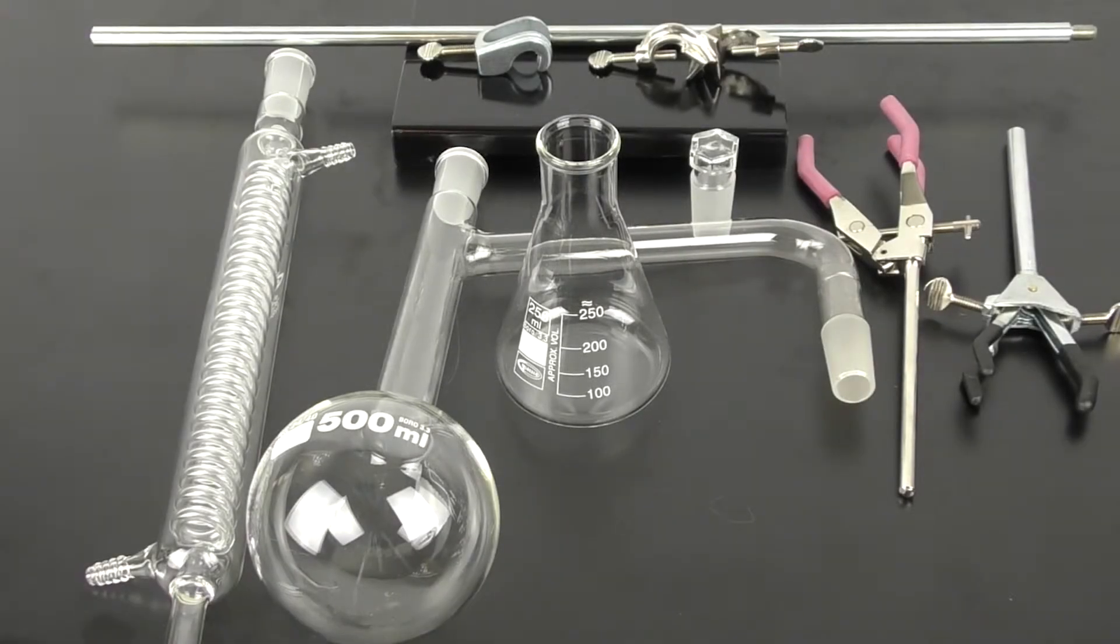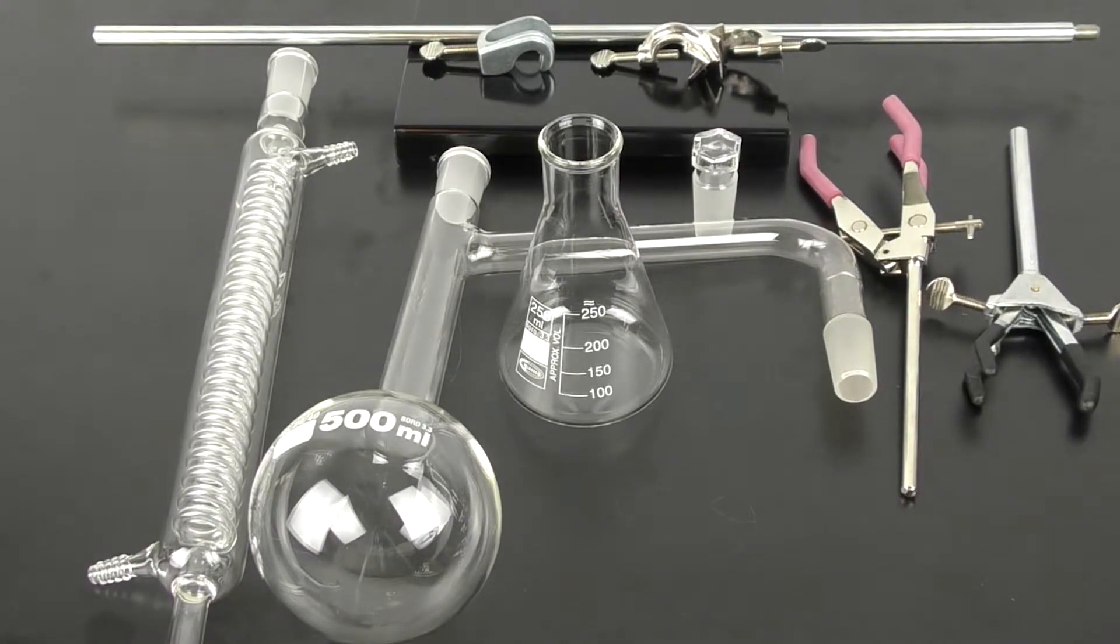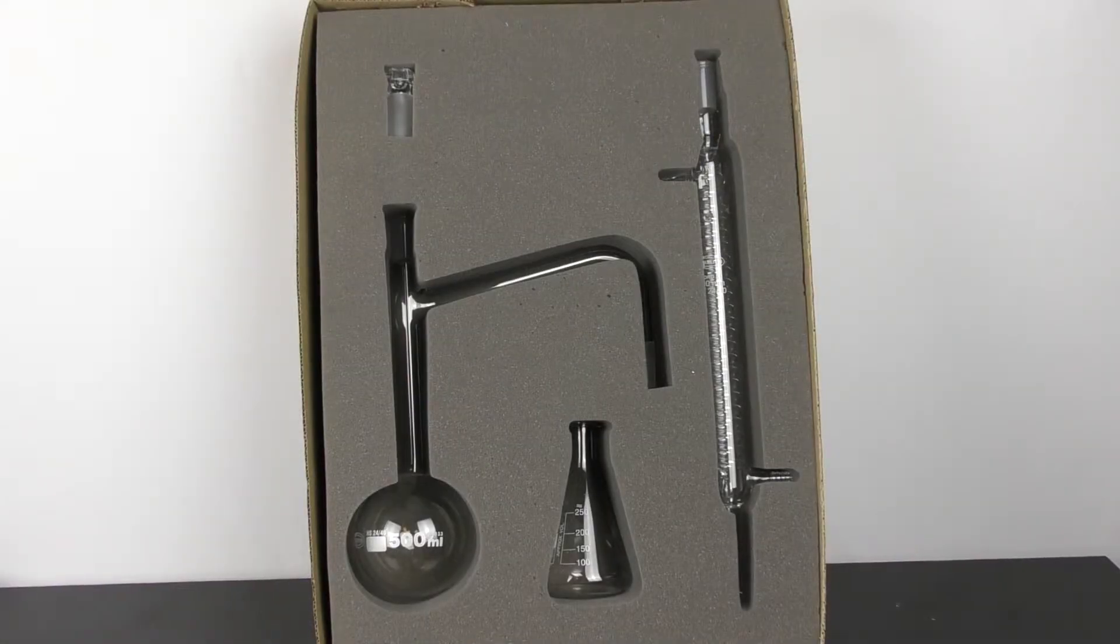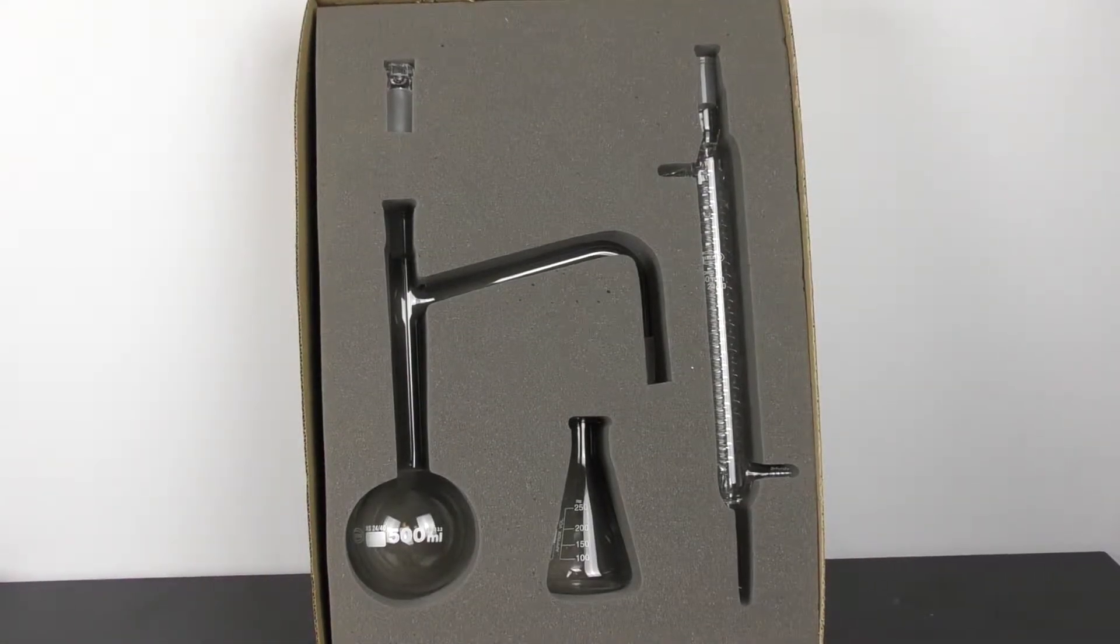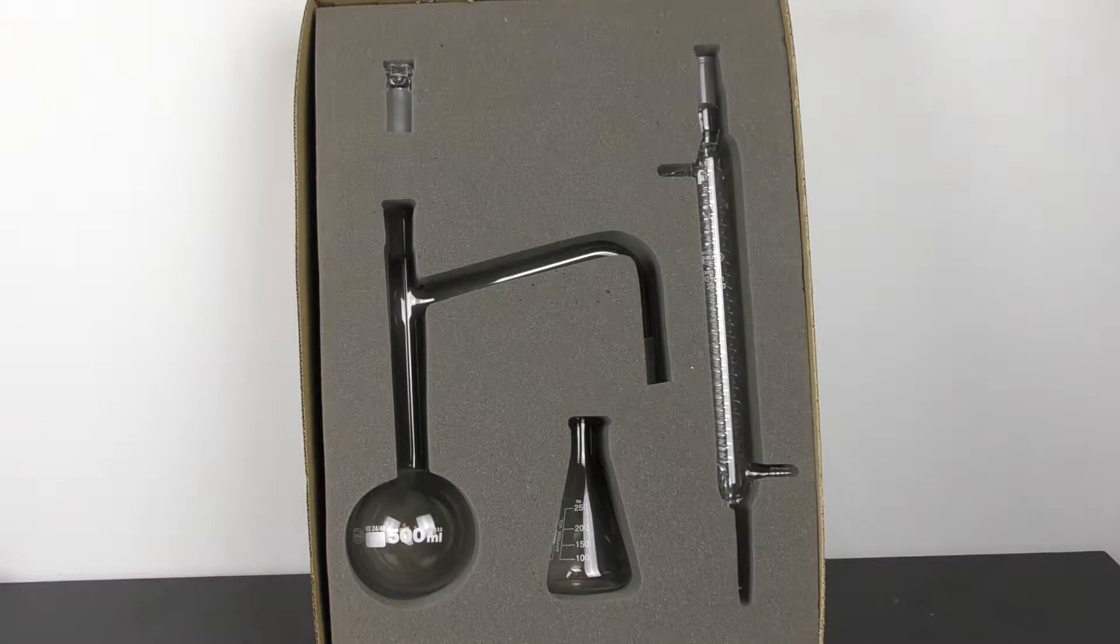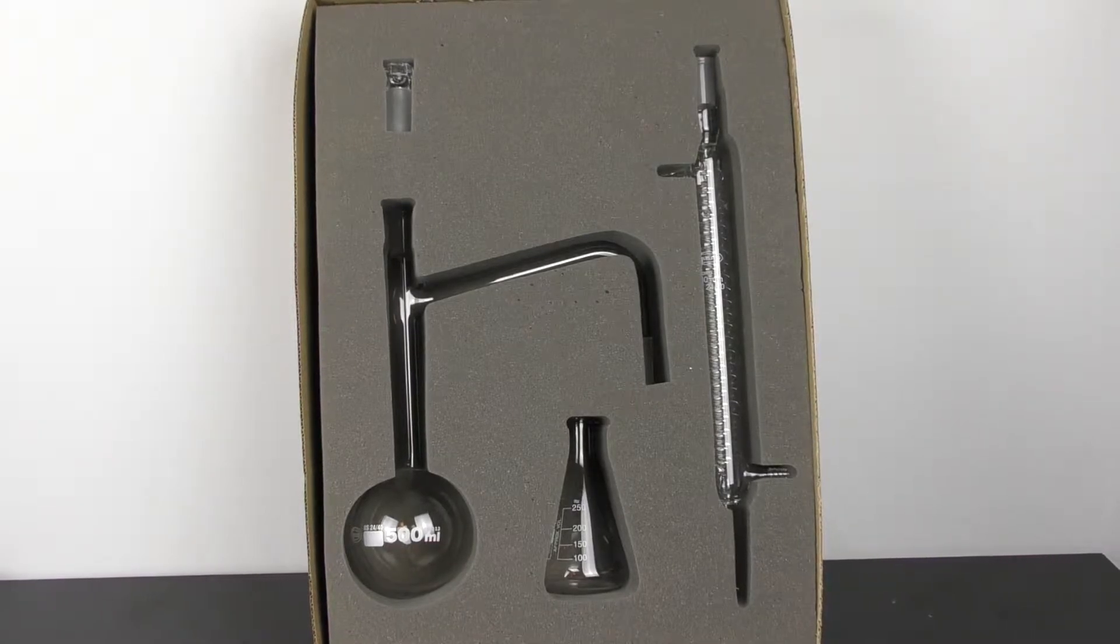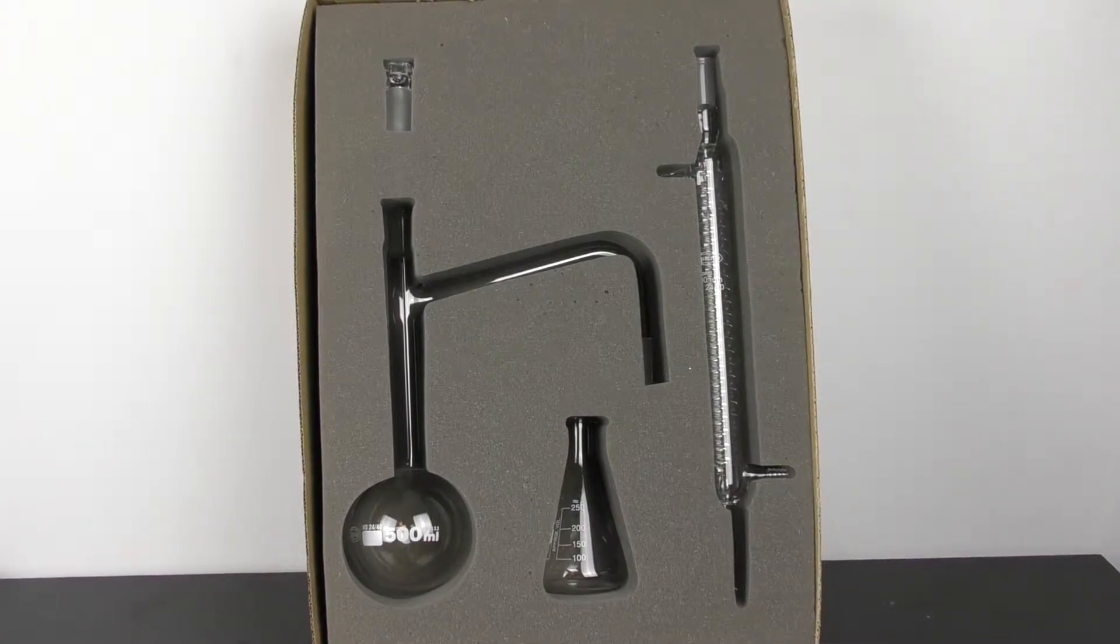The distillation apparatus contains all the required glassware and support materials for performing simple distillation experiments. The glassware comes in a custom-made foam insert to ensure that it gets to your classroom safely and it can also serve as a storage solution.